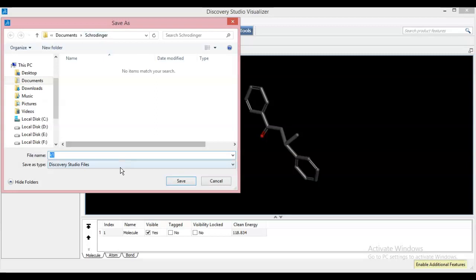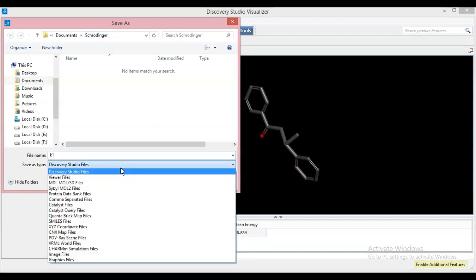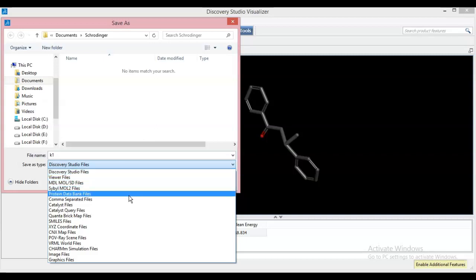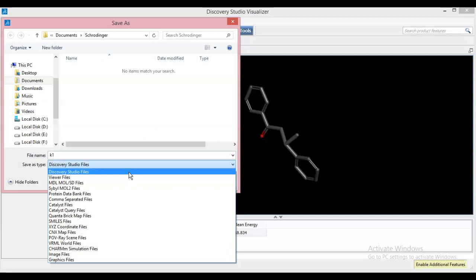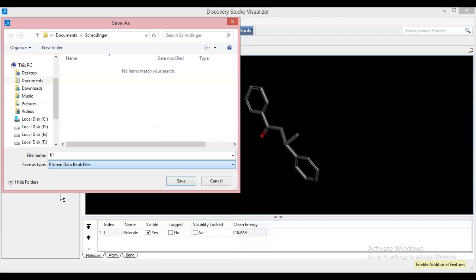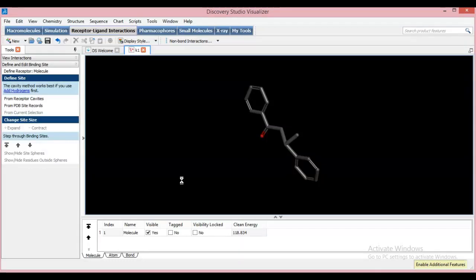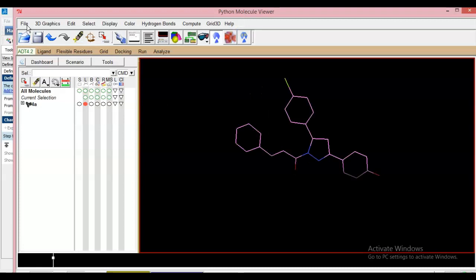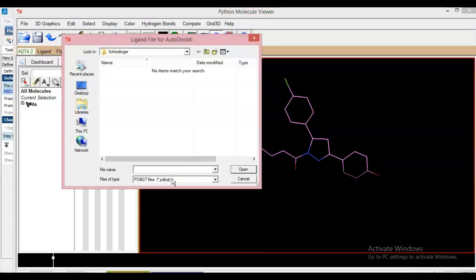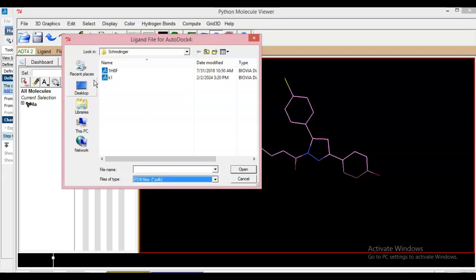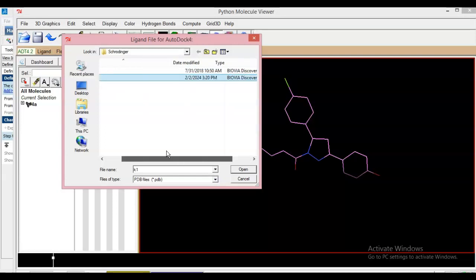The Schrodinger folder is open. Discovery Studio makes available two kinds of important file formats to save: first is the PDB file format (Protein Data Bank file), then MOL2 type or DS type files. I will prefer the Protein Data Bank file, so click on it and save. Now this file is saved. Let us check whether the file is accessible in AutoDock — open AutoDock, go to Ligand, then Input, and click Open. There is now a PDB file. K1 has been converted to PDB format.